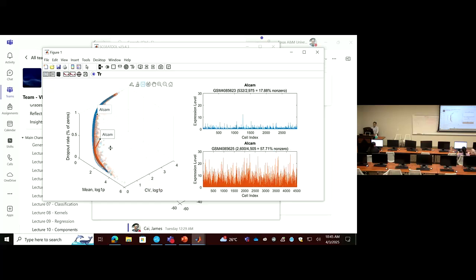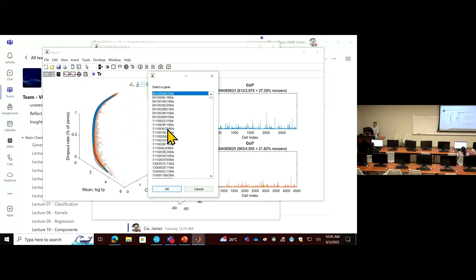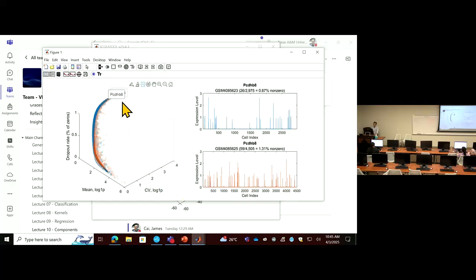Okay, I think we can finish off this part. So those are the genes. If you are interested in some of these, you want to check what the gene expression change is. For example, this gene, there's no change. They're all on the same position, same curve, location. So this is not an interesting gene for us.